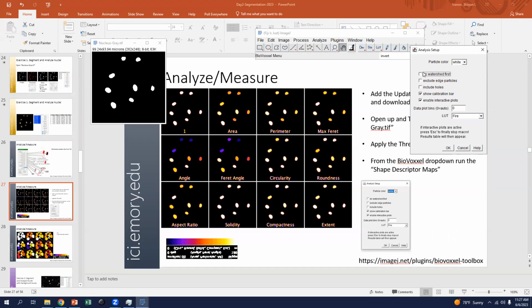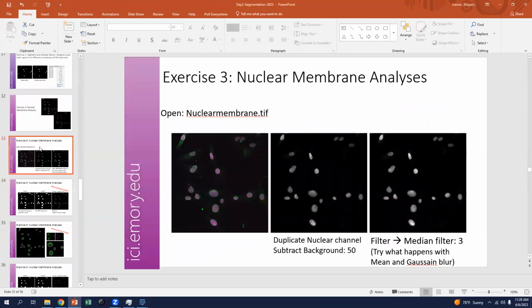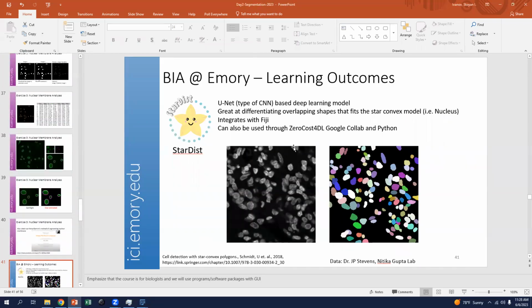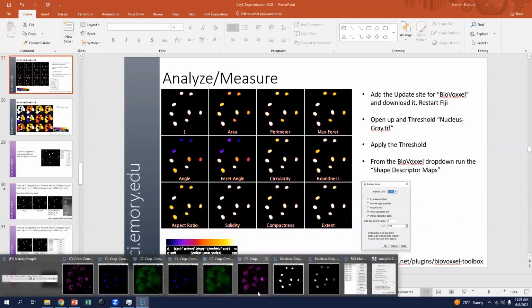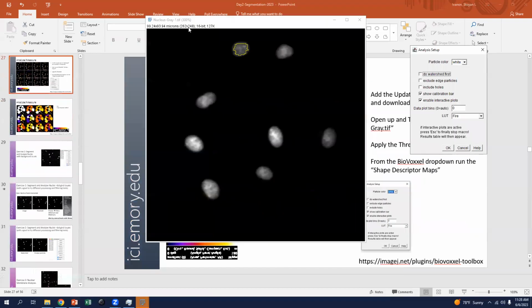Do watershed first. This is for structures that might be very close to each other, two cells that are right next to each other. And the watershed will attempt to split up such clumped objects. So it is useful for one instance here, I'm sure. Yeah, if cells were touching in this way, the watershed algorithm will attempt to create a break in between them at the most logical place, which is not always what you would think is the most logical place. But we don't need that here because none of our structures are touching. None of them are next to each other.